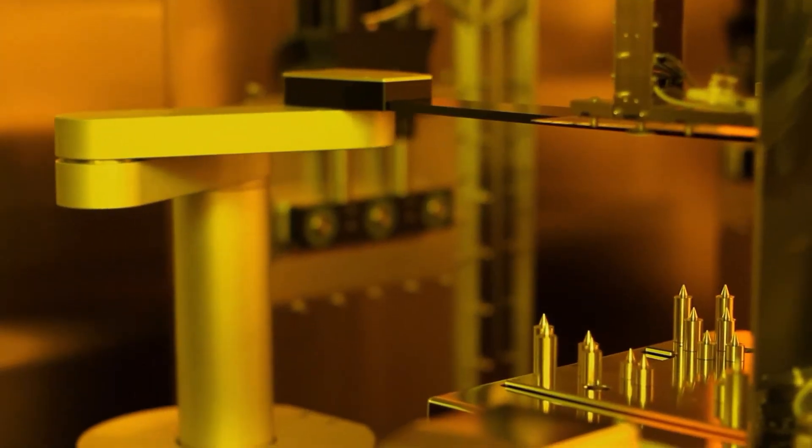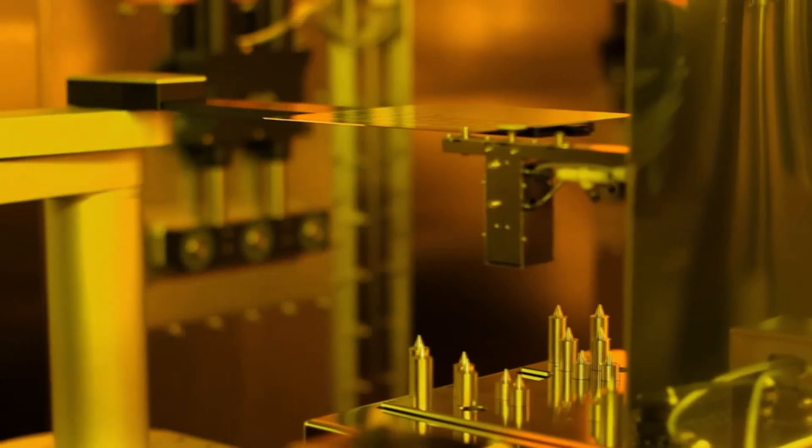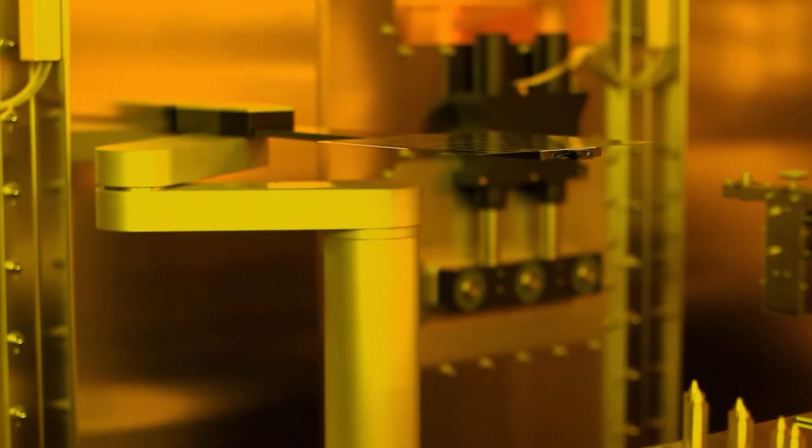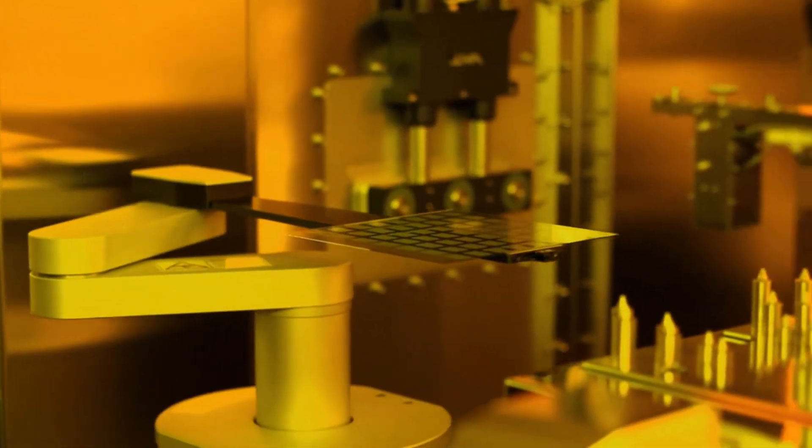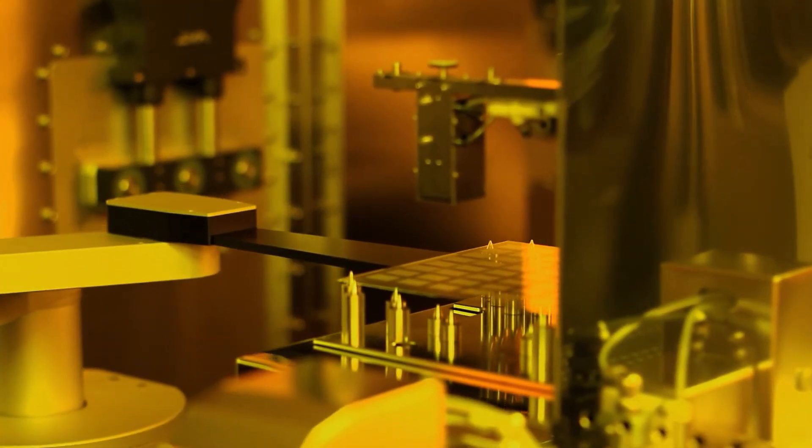The flip tool rotates the substrate through 180 degrees, carefully handling in the non-active areas of the device in preparation for the vacuum evaporation process. Precise alignment checks are carried out throughout the production flow to ensure accurate substrate positioning at each process step.